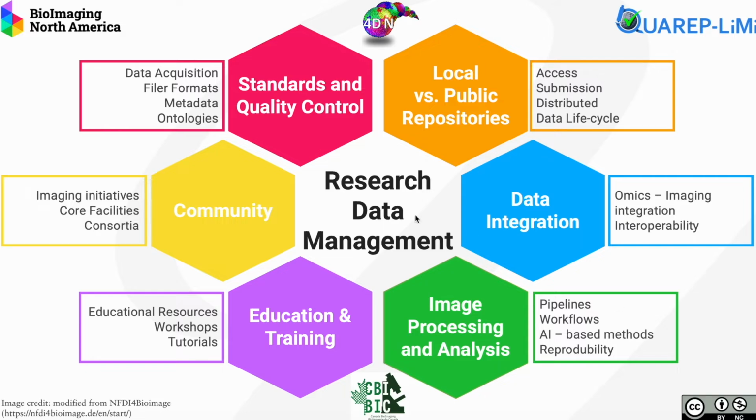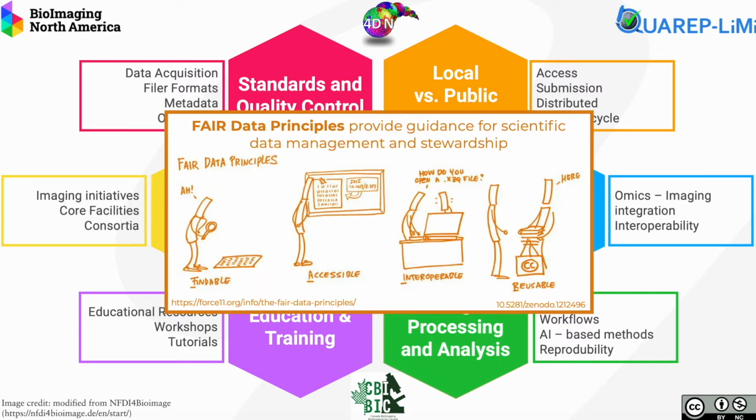It is important to know that we are not alone in this work, and that guidelines and principles to help us define what are good scientific data management and stewardship practices have been proposed. And these principles are increasingly being used by funders and publishers to evaluate the quality of our data.